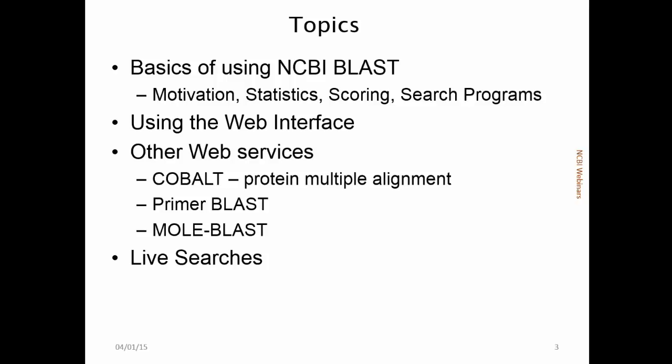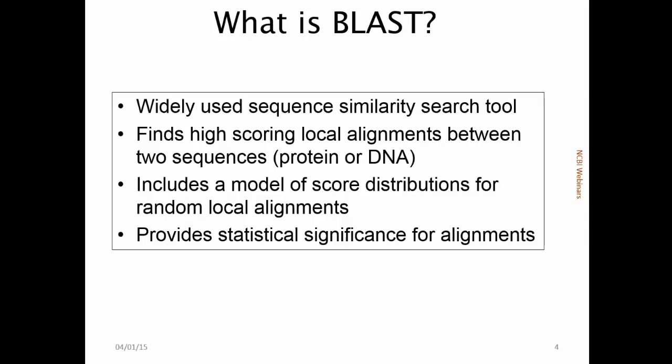And then we're going to focus a lot of the slides on the practicalities of using the web interface, some things that you need to know about that we recommend you use. And then we're going to talk about some of the other services that are extensions of BLAST: Cobalt, which is our protein multiple alignment tool, Primer Blast, which is our primer designing software, and a relatively new clustering tool called Mole Blast. And once I get through the slides, we'll go ahead and do some live searches using BLAST itself and these extensions of BLAST.